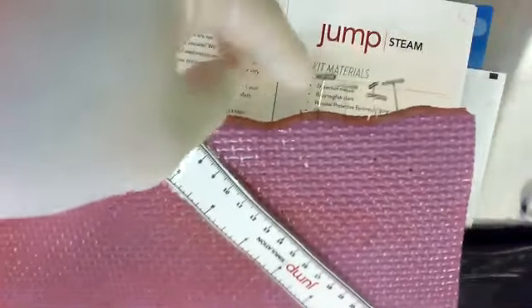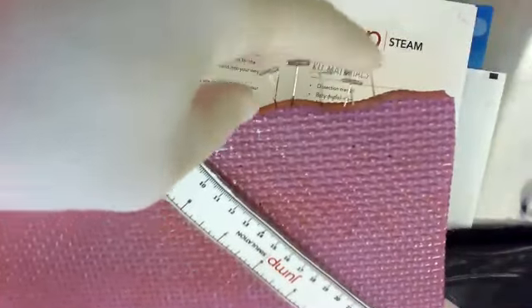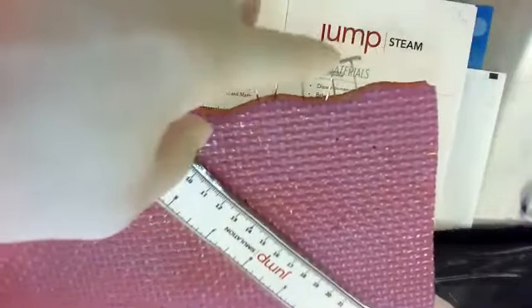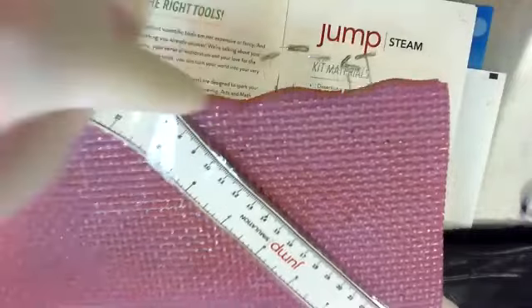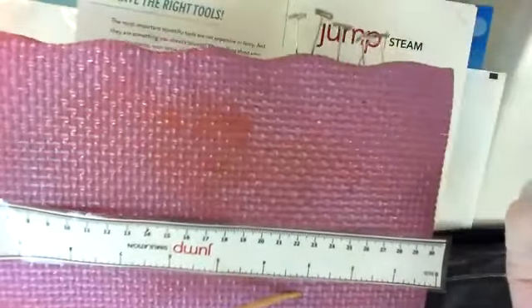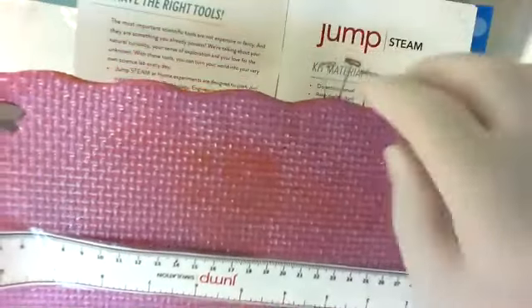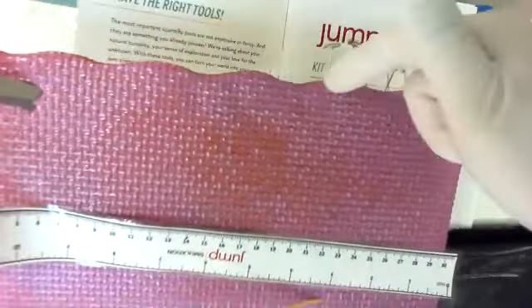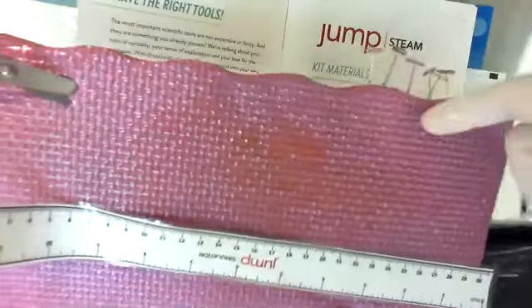You've got the cushion. You have 6 pins: 1, 2, 3, 4, 5, 6. Always know if you have 7 pins or 5, it doesn't matter. You just need to know where they're at all the time because they are sharp. And if they have formalin on them and they poke into your skin, it'll irritate your skin, make it turn a little puffy and red. So you don't want to grab it, and you don't want to squeeze on it and stab it right through your hand. So always keep your sharps protected.